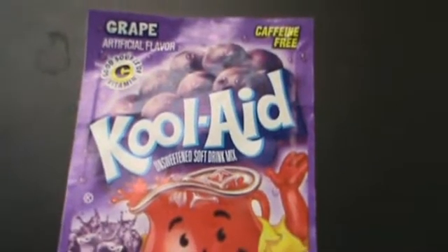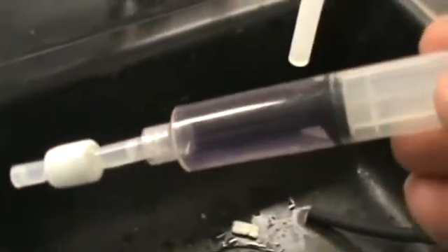This is the Kool-Aid Lab for IB Chemistry HL. I have some grape Kool-Aid, just the mix, no sugar.